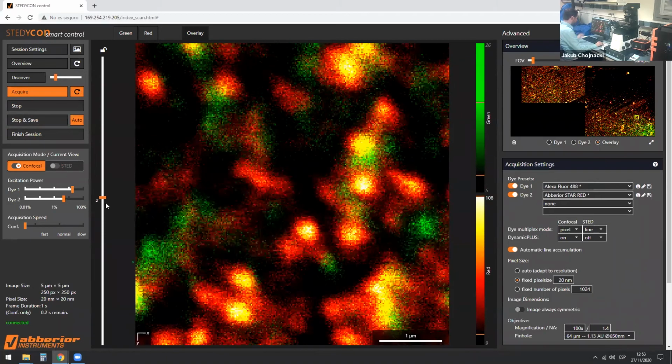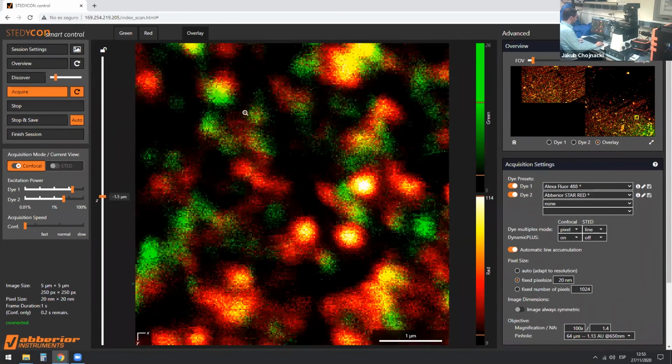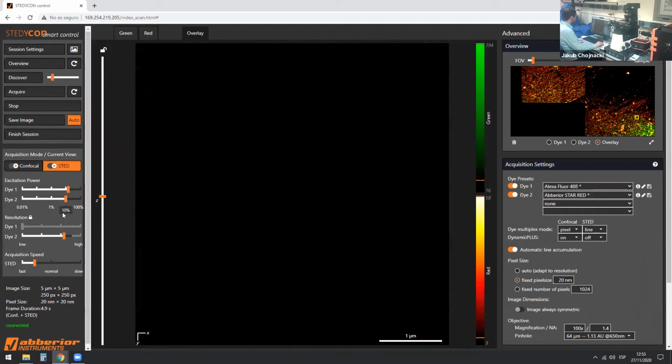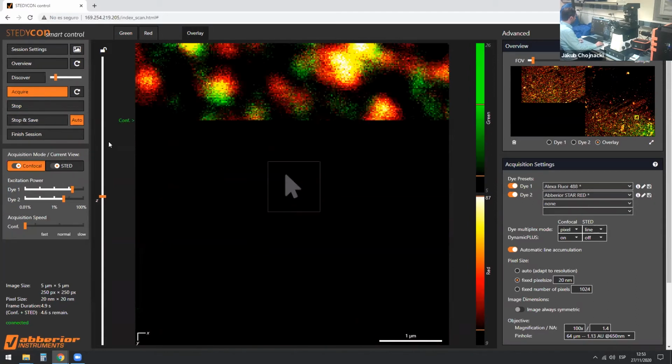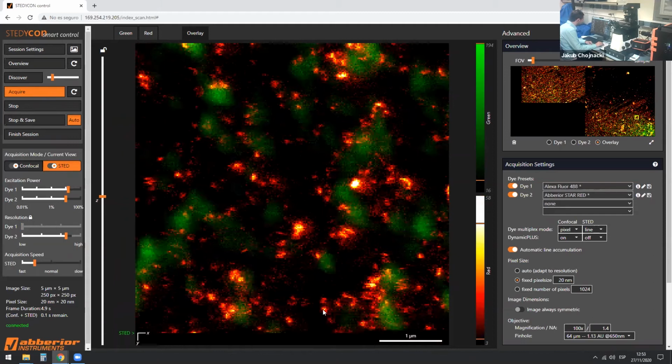Okay, so this is a confocal image. This is standard microscopy like before. Let's focus a bit on individual virus particles, and let's image them in high resolution. So we're going to acquire first a confocal image and now a super-resolved image.